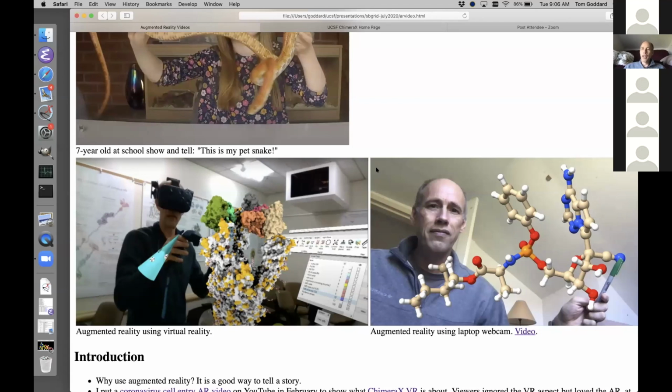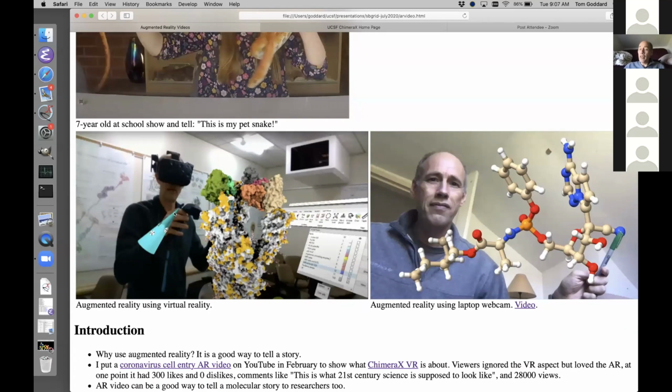And so in February, I made a little video that I put on YouTube showing how coronavirus gets into cells. And I did it in VR. There's the image on the screen. So I made this video on YouTube, and the point was to get people interested in using VR. Look, here I'm using VR to show something about coronavirus that you might be interested in. Everybody ignored the VR, okay?